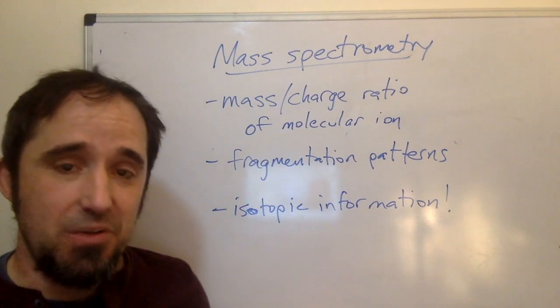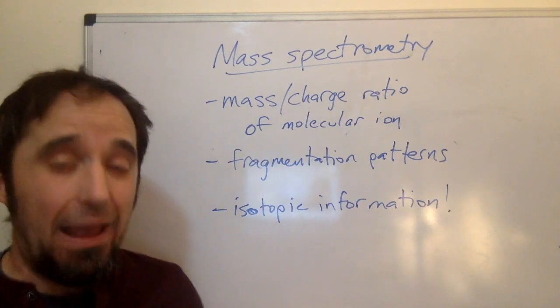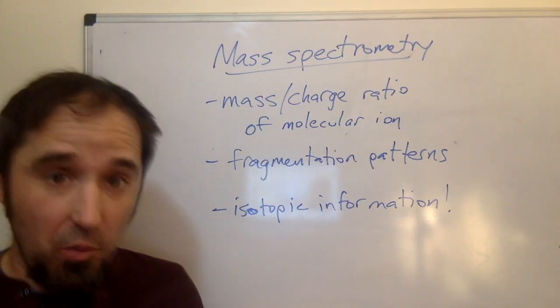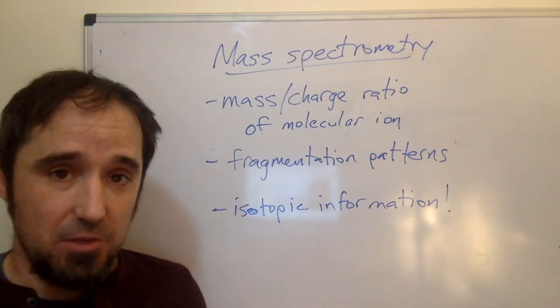Mass spectrometry. This is a really important general tool, not just used by chemists, but increasingly used by biochemists and biologists in more of a big proteomics way. But we're going to start with small molecules here to talk about the basis of mass spectrometry.